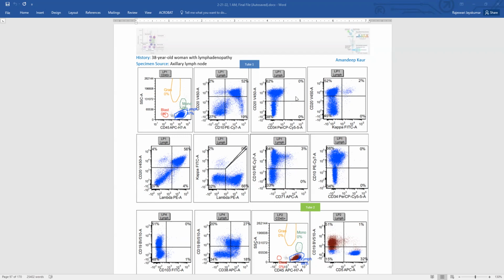This is important because not only certain mature B-cell lymphomas, immature B cells also express CD10. So if you remember, your B lymphoblasts usually express CD19 and CD10. So any time you see a CD10 positive B cell, you should always make sure the population is mature or immature. And there are certain clues to that. One, immature cells will obviously express immaturity markers like CD34 or TdT. And two, in CD45 versus side scatter, they usually sit in the blast gate. That is, they have dimmer CD45.